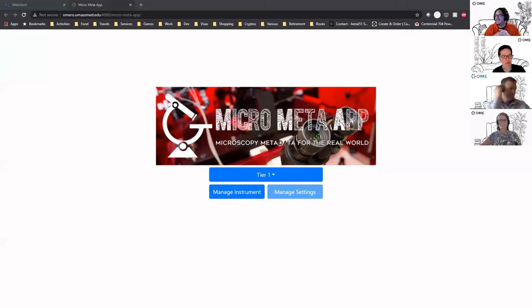Yes, very familiar with that problem. We have another two labs that are helping us with testing the OMERO plugin a little bit. But again, as you saw, it's very early stages. There is no permission yet regarding which user is logged in. Every user can see each other's microscopes, or each other's image acquisition settings. But we are trying to push the development on that side.